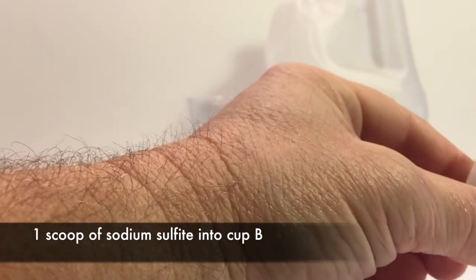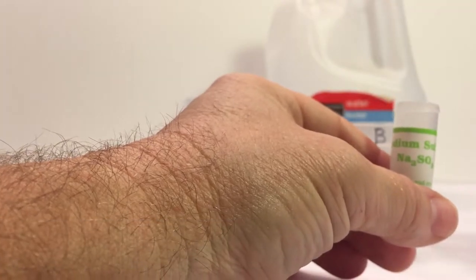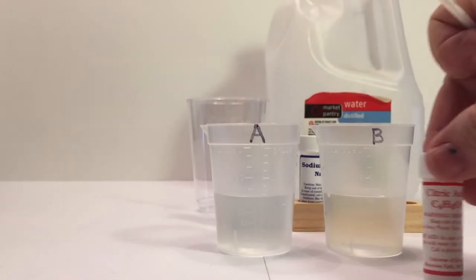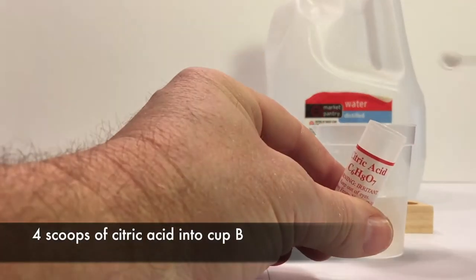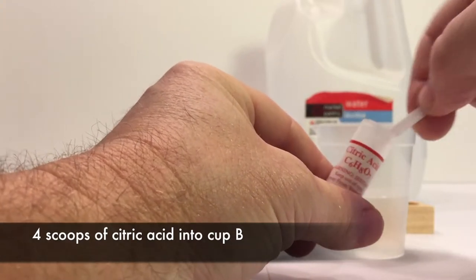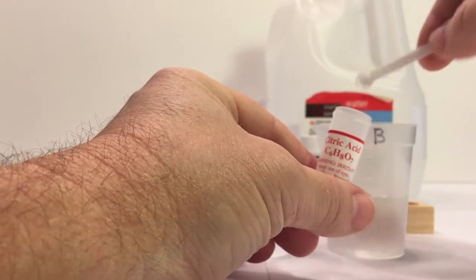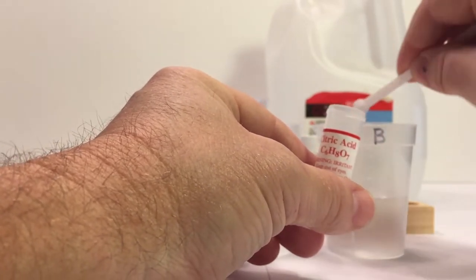So all these chemicals come really nicely in small little containers and they're labeled very well. And so you use the scoops and you're going to put these into B. And we're going to do four scoops of the citric acid. And I did one scoop of the sodium sulfite.